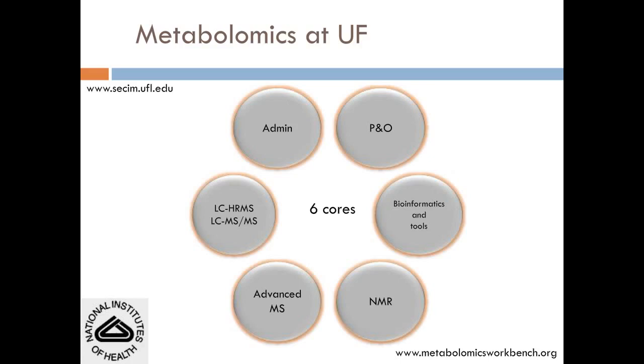analytical side that includes nuclear magnetic resonance for quantitative metabolomics, and advanced mass spectrometry that includes the imaging mass spectrometry capability. And then, of course, my core, which is liquid chromatography, high resolution and tandem mass spectrometry, in which we do multiple kinds of approaches to probe the metabolome.